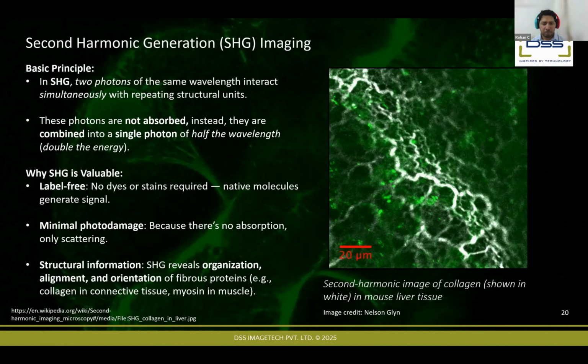It is possible. But since it is mode locked at 800 nanometers, the emission that you'll get out of it will not be as efficient as what you can achieve at 920 nanometers. But I would suggest you use as many blue shifted fluorescent proteins or blue shifted dyes as possible. Thank you so much for the clarification. Thank you.